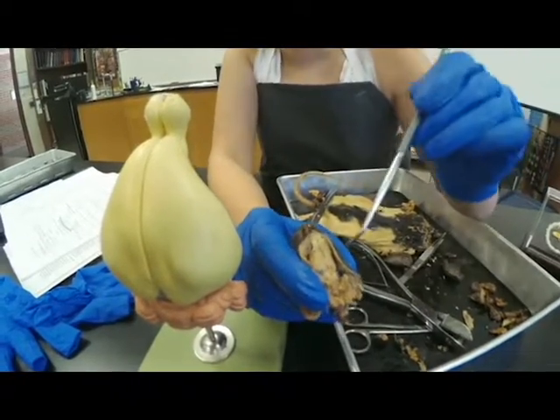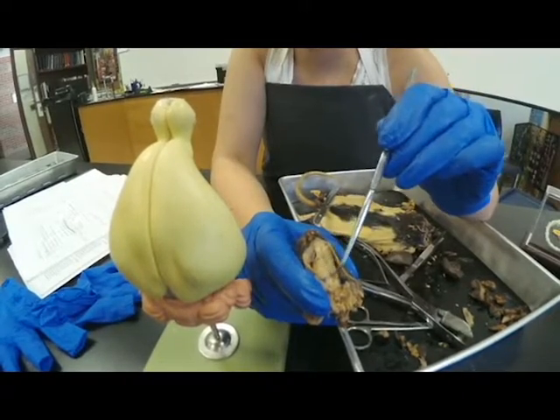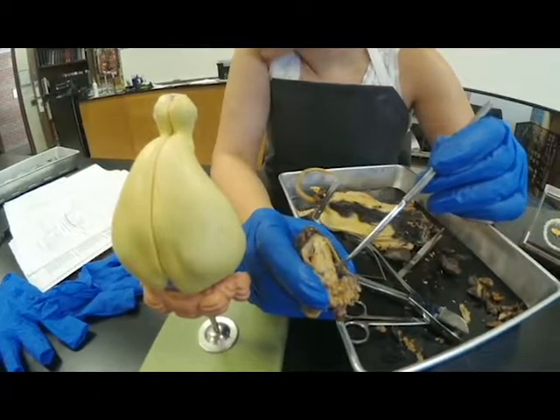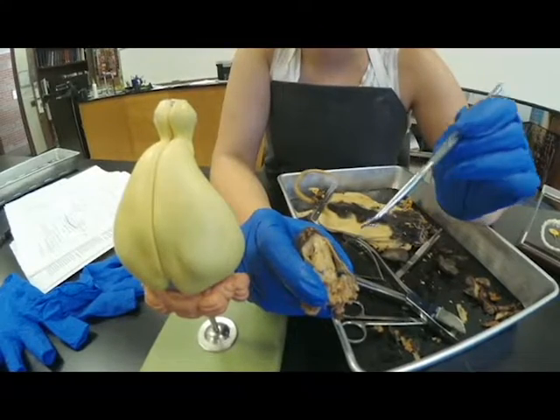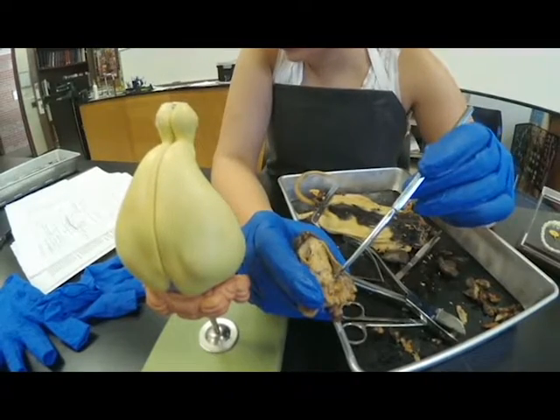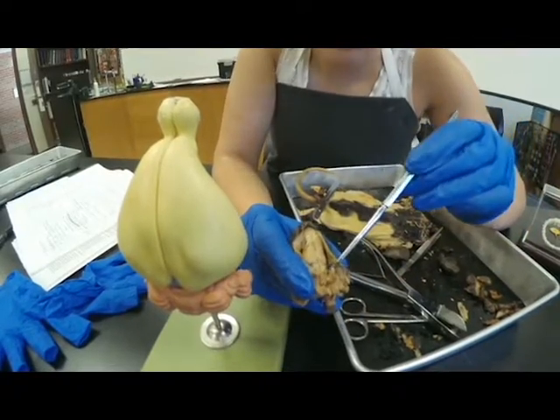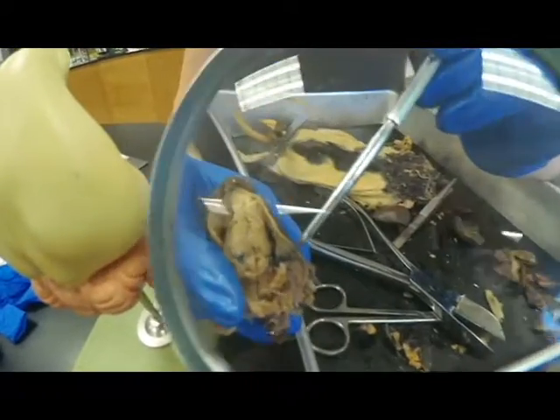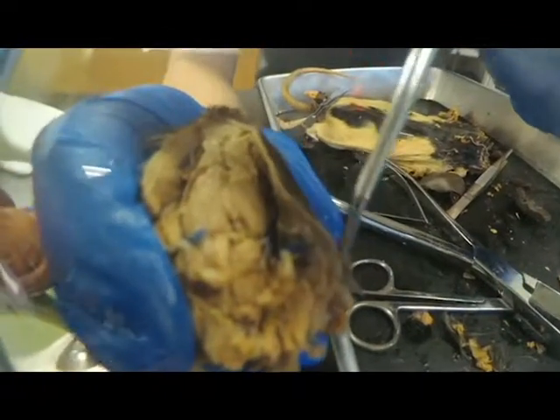Okay, so here we have the cerebrum, and it's just this portion right here, and it's this portion here on the model, and that is going to have to do with complex thought and processing. Here we have the cerebellum, and that's going to have to do with depth perception and balance, and so that's going to be this pink part here. If you look closely, you can see the folds right here. They're there, I promise. I don't know if you can see it on the video, but they exist.